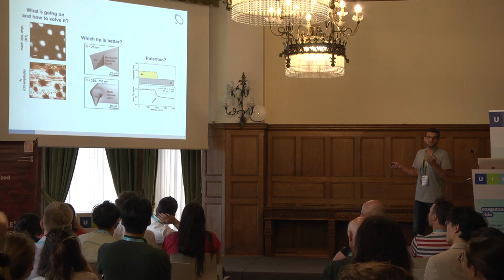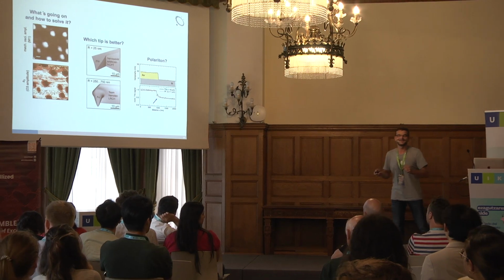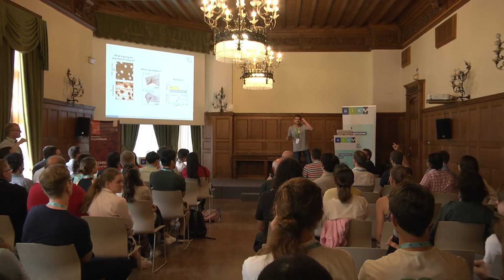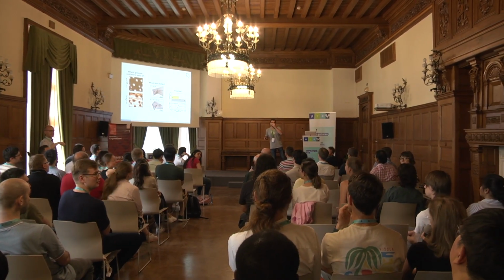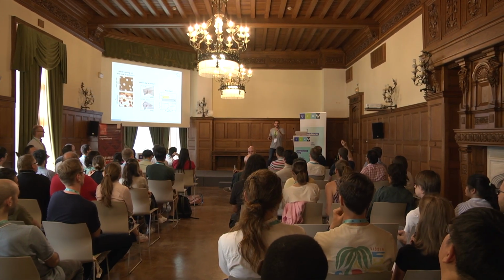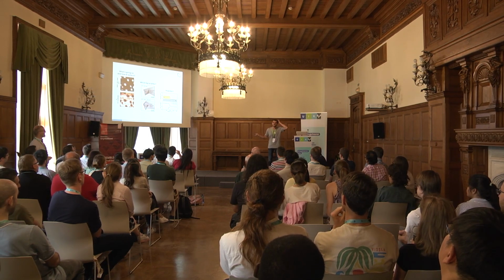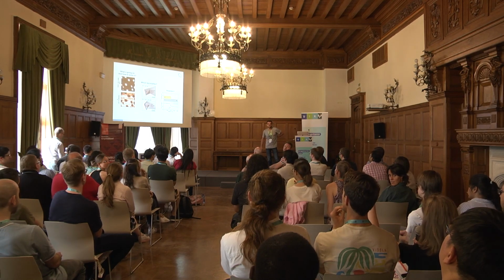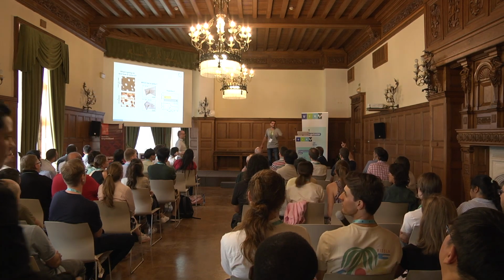Okay, so we have, you see that? Somebody else who wants to? Change of tip radius, because no. Yeah, next one. Bad scanning parameters. Maybe the tip is flying over the dirt too fast. Yeah, becoming in the right direction. If you change the scan parameter, we can fix the problem. Yeah, because the edges of these spheres are not so sharp. So maybe the scan parameters are wrong. Okay, so last one, then we need to move on.